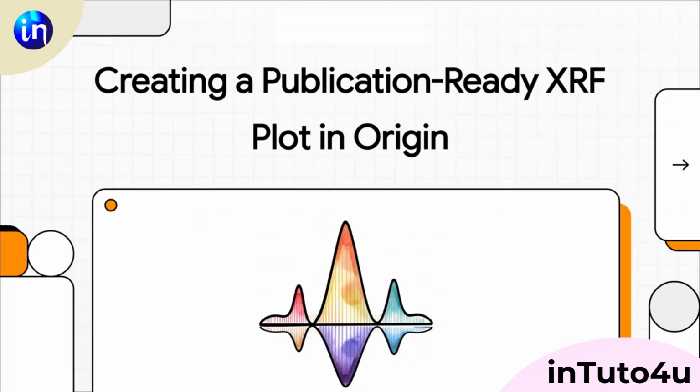Okay, let's just jump right in. If you're working in materials science or chemistry, really anyone doing elemental analysis, you already know the deal. You've got this spreadsheet packed with raw numbers, and now you have to turn it into a powerful, professional-looking XRF plot in Origin. So let's get it done.